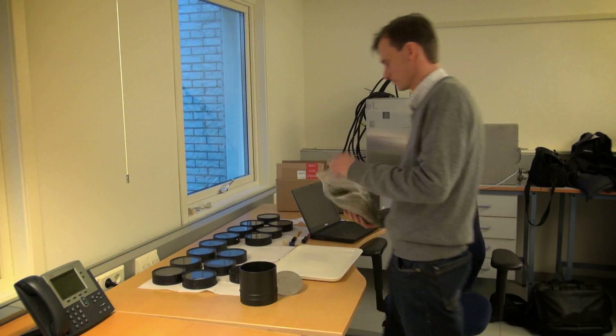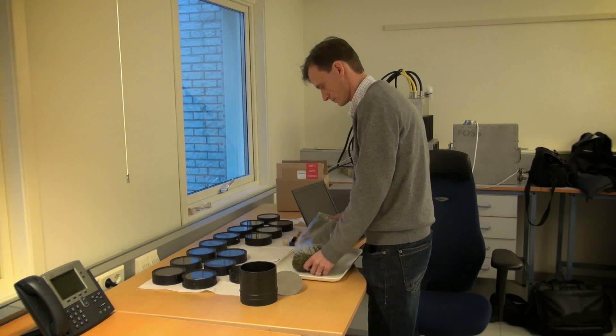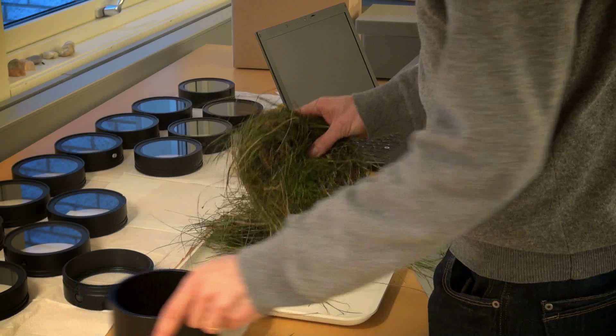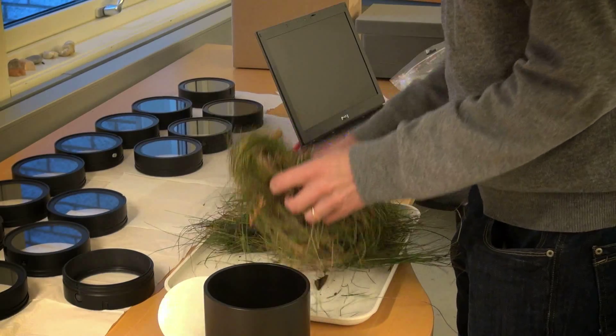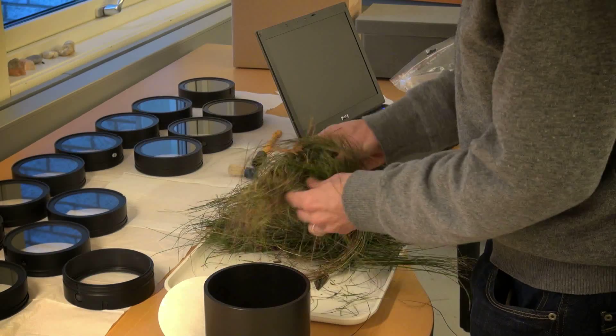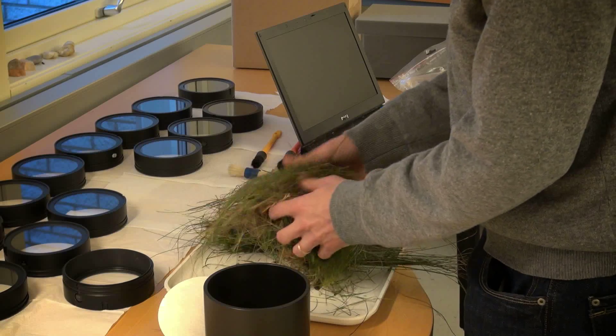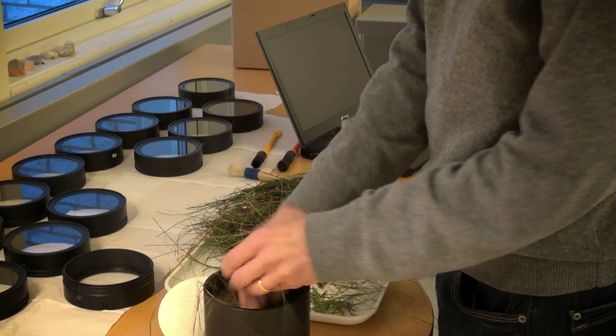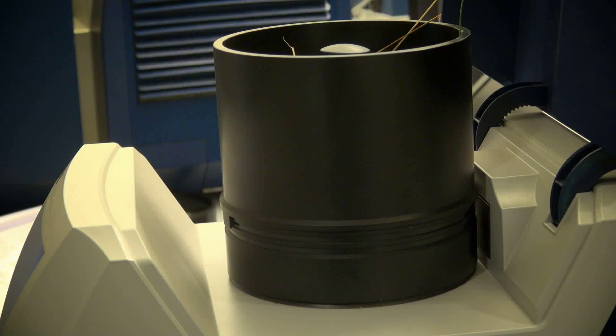The sample presentation is the most critical part of the instrument. You want to measure as much as possible of the sample, which means you want to have a large cup for the wet forage — a large cup and measuring on many different points. It should be easy to pack the sample homogeneously in the sample cup.